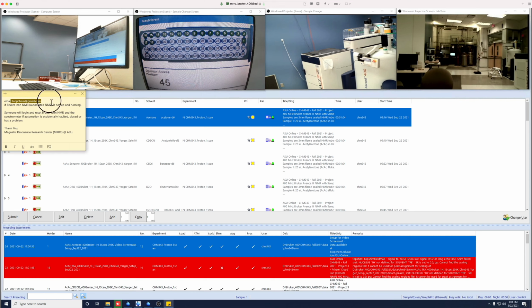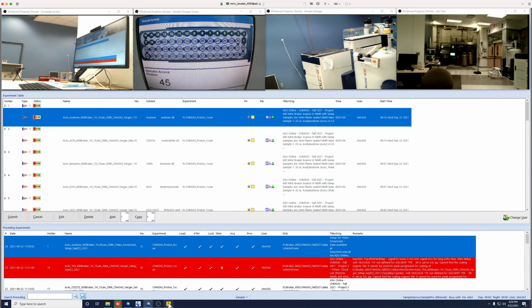which you would do to be sending your samples anyway, or if this is class related or Pchem cloud related, you can email biopchem@gmail.com. And that's exactly what you would email if you do not see more or less this exact view up. If windows have been closed, if things have been logged out, if the instrument isn't in this kind of working order, if different software has been opened, then you can email and the system will be reset.